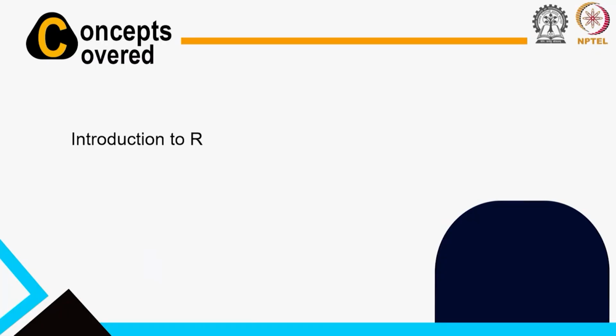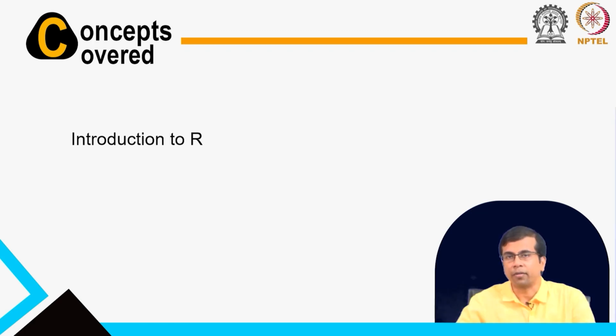So, today's agenda will start talking about a programming language called R, right. This is a platform where we can do a lot of statistical analysis. A lot of the packages are built on this R platform, and when we talked about the analysis part in the theory, we mentioned there are packages that are implemented in R, and we will see there are so many tools that you can use for doing this transcriptomic analysis.